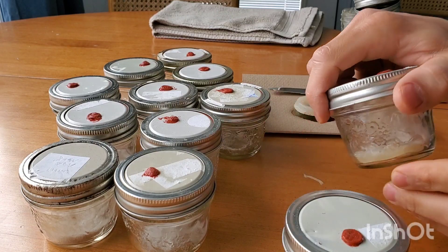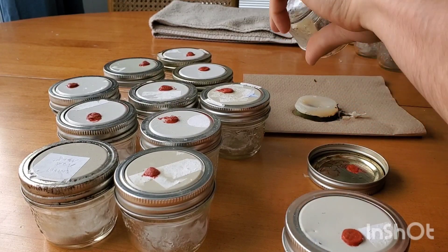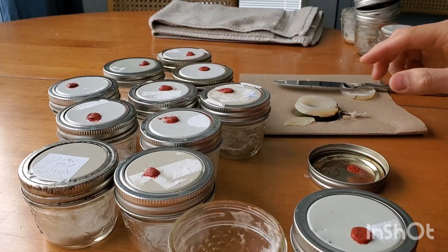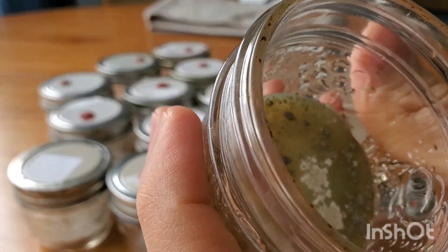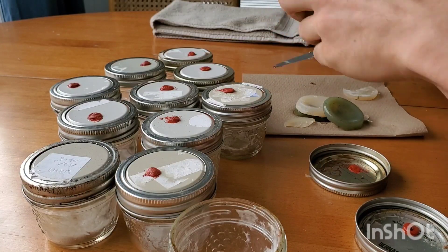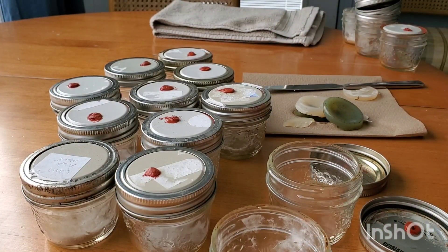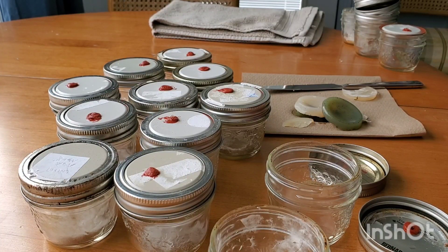So what we're going to do is open up these jars and remove the previous agar. As you can see, this one's pretty contaminated, but that won't be a big deal at all. Then we're going to clean these in the kitchen sink like you would any other dish, let them fully dry, and prepare a new batch of agar to pour inside of them.